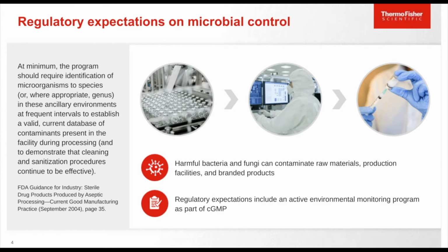Due to the possible harmful effects of microorganisms, regulatory agencies expect pharmaceutical organizations to have an environmental monitoring program as part of good manufacturing practices. It is also recommended to identify microorganisms at the species level at frequent intervals to establish a valid, current database of contaminants present in a facility.